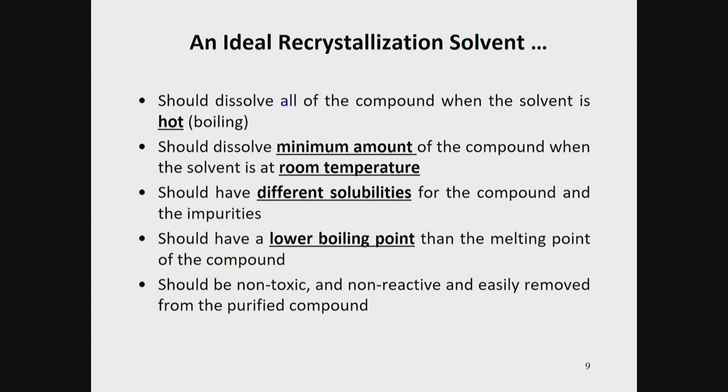So what would happen? Imagine you're heating up this solvent, which has a super high boiling point, higher than the melting point. You reach the melting point of the solid that's in the liquid, and the solid starts to melt. And then it will be really difficult because now you have two liquids, one liquid suspended in another. Very difficult to try to get that solid back. Okay, so this is a very important point.